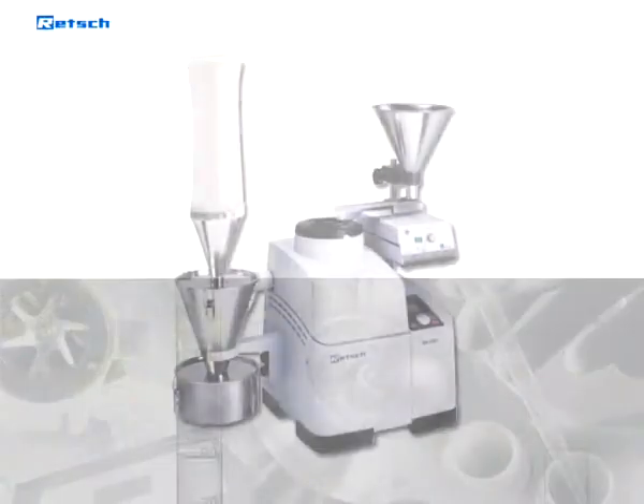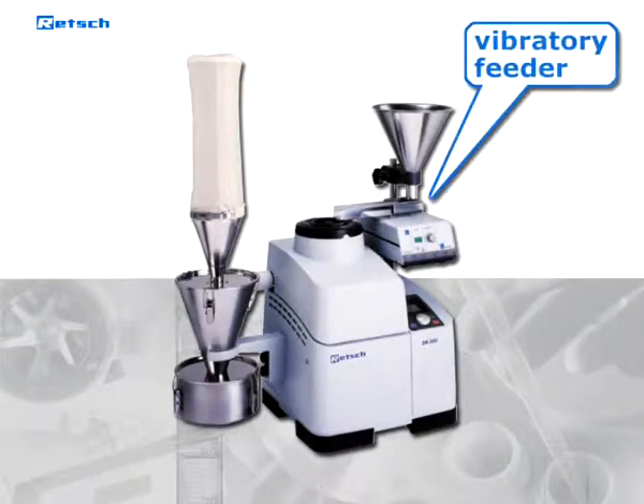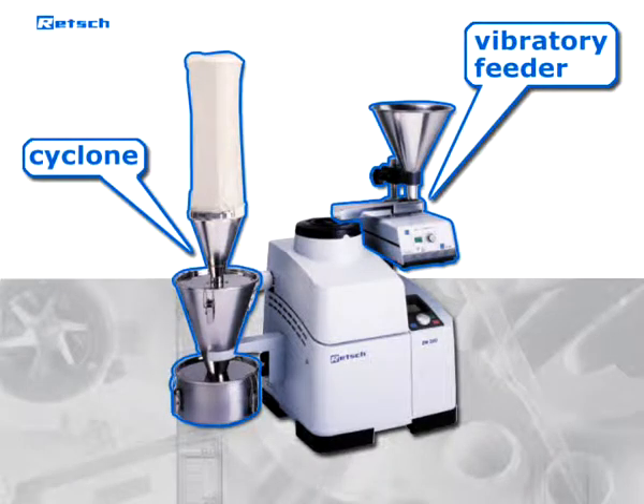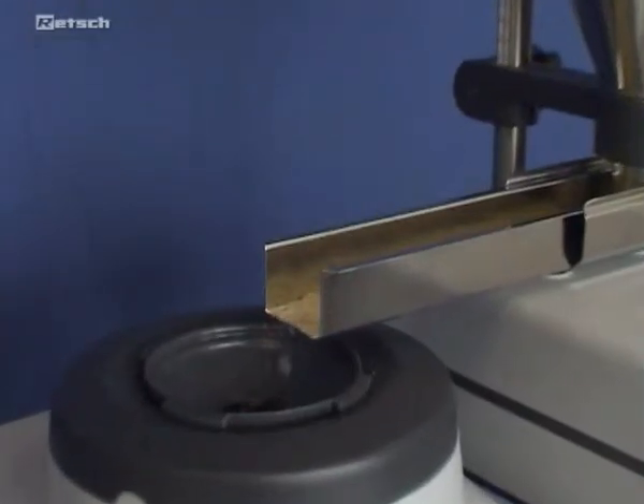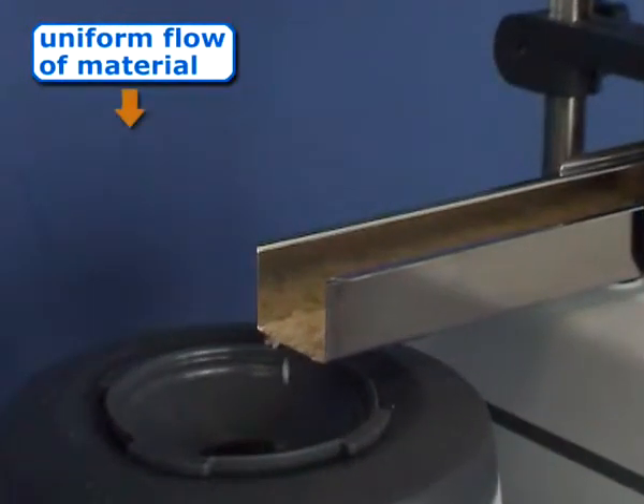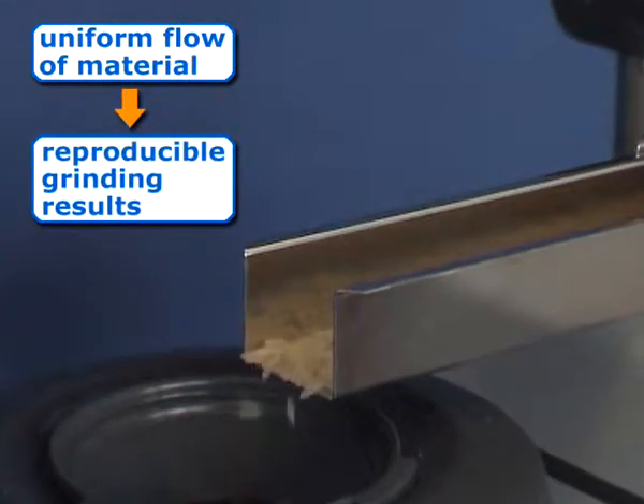To further simplify and optimize your comminution process, a vibratory feeder and a cyclone are available. Automated sample feeding via the load-controlled vibratory feeder DR100 guarantees a uniform flow of material and therefore reproducible grinding results.